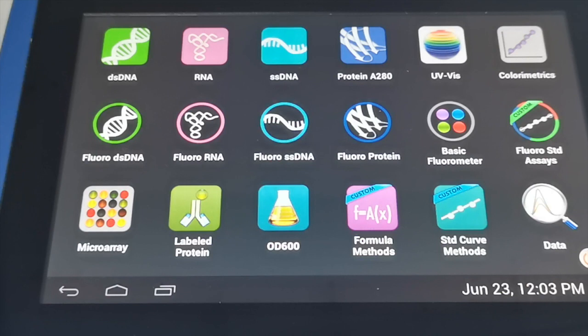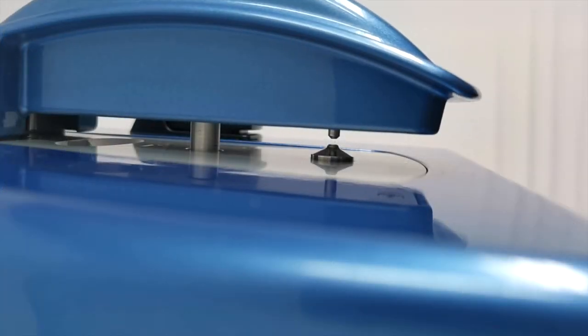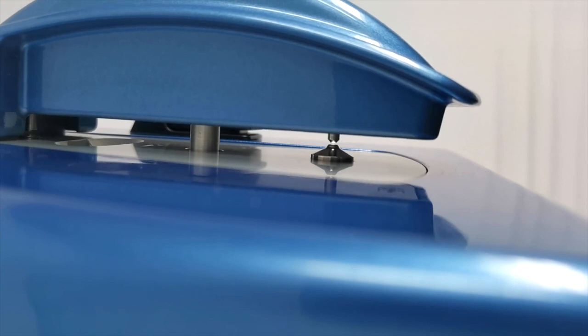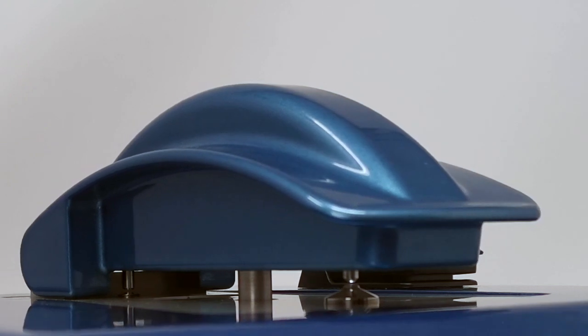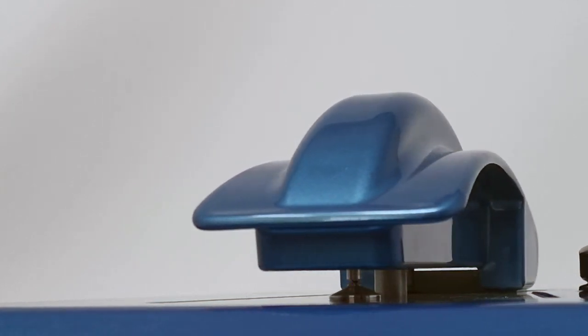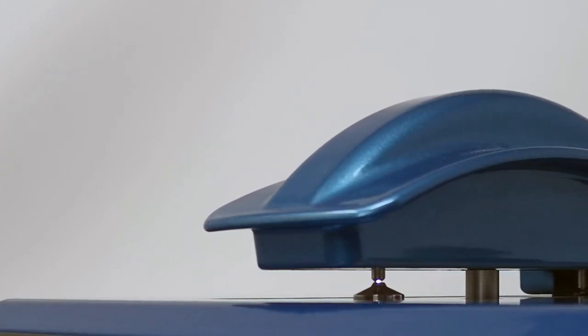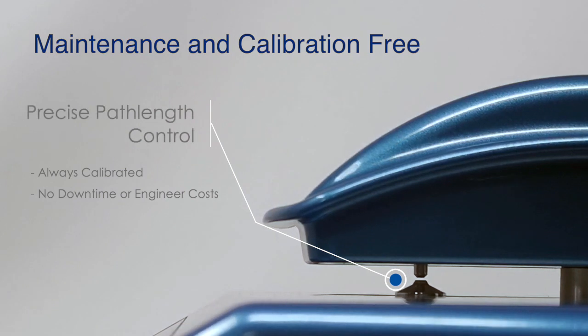We start up the app by touching it, and as you start up any measurement app you'll hear it go through an initialization. This sets the high-precision screw that controls the path length — it finds its home position and from that it can calculate any path length. This is a key feature of the DS11: the screw characteristics never change over the lifetime of the instrument, so we don't require calibration checks every six or twelve months and can guarantee it's always within calibration.